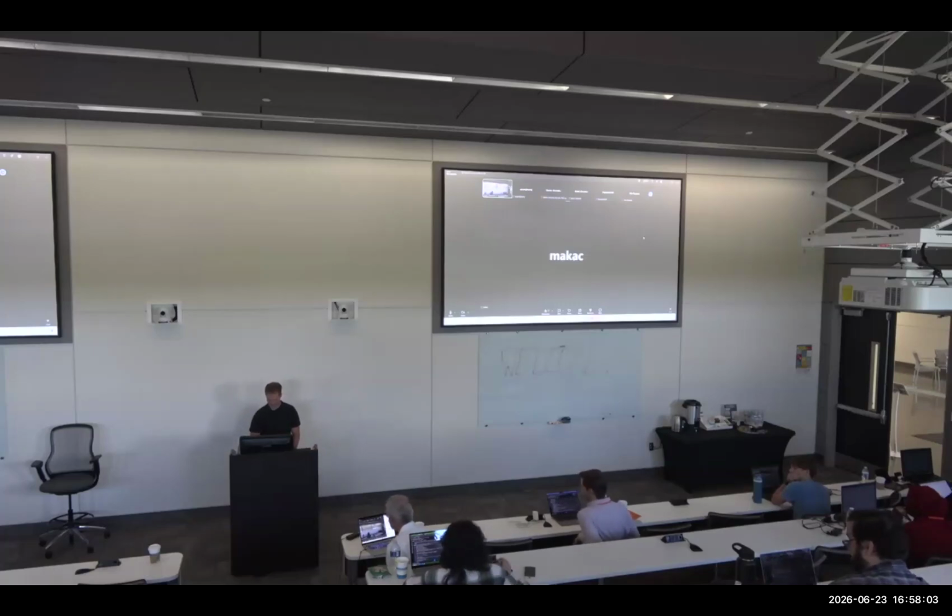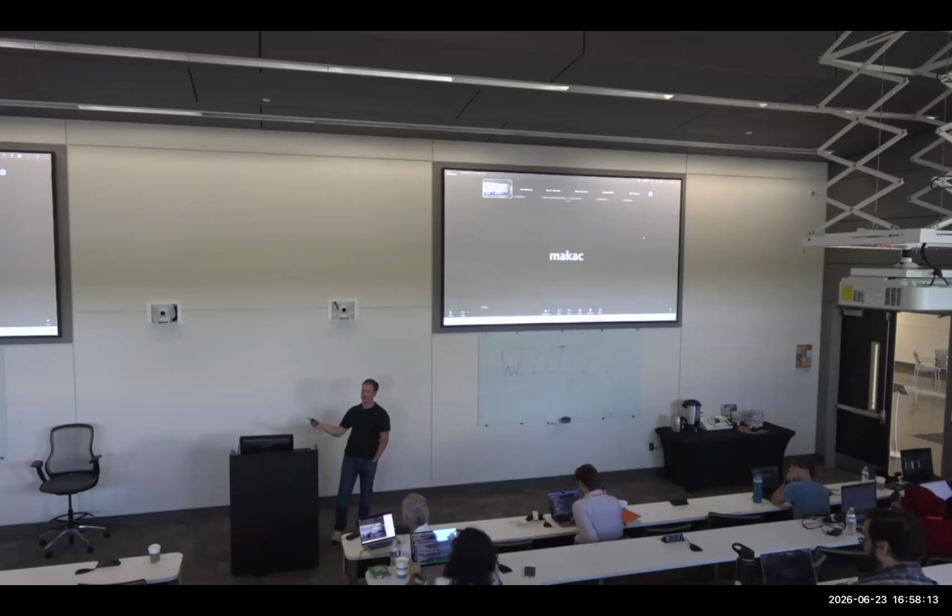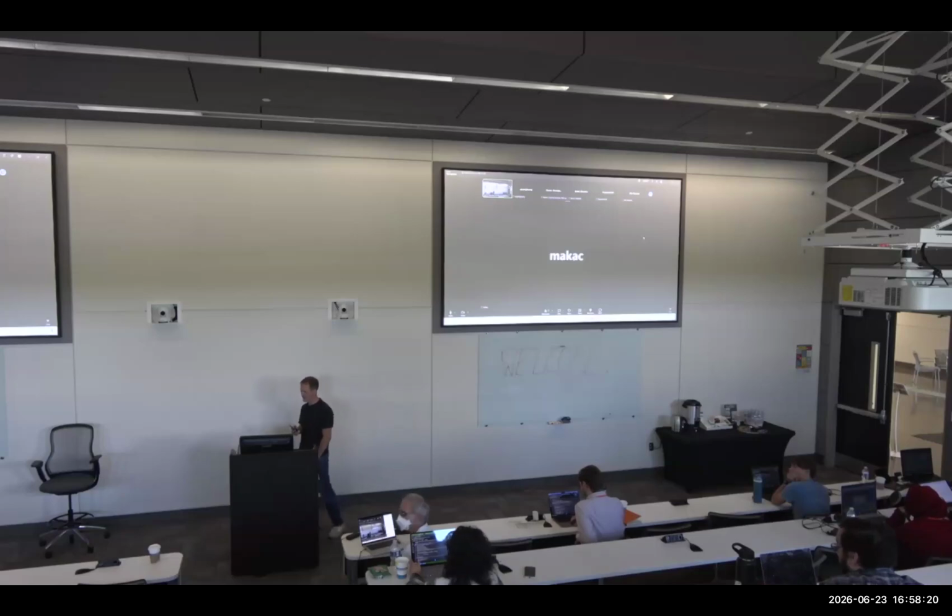Yeah. Okay. So the idea was just to copy the code over from the 3 p.m. notebook and use it in this notebook because you have an image or are sampling a scalar. So keep playing around with it, and then if you get anything good, just send me your code and we can run it in real time on the microscope. We don't even have to change anything. So that's it for the hackathon.